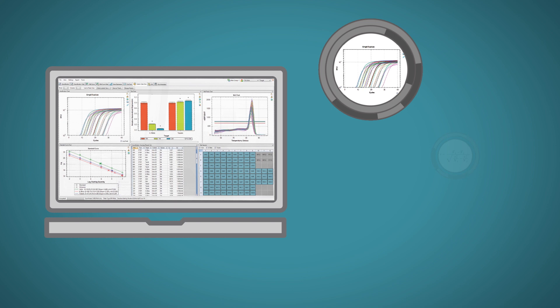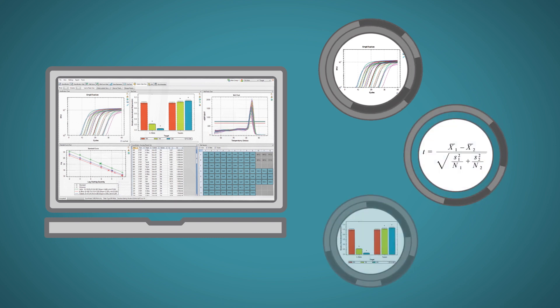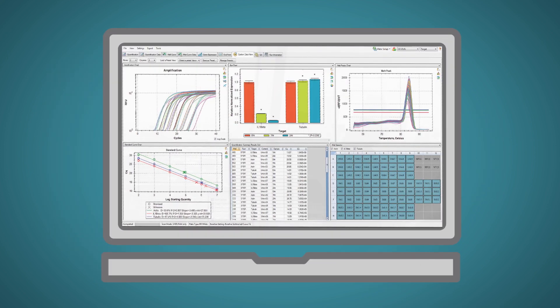It's real-time PCR data analysis, statistics, and graphing all in one integrated tool.